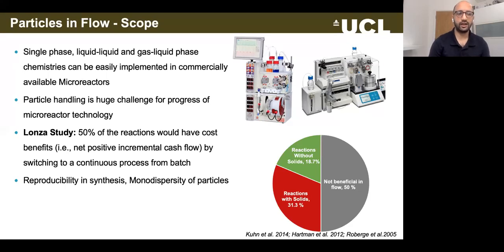And with time, the technology has developed, but it still shows the importance of the scope of the microreactor technology, which can be used to perform different solid-related reactions. So it quantitatively demonstrates the importance of research to develop solid handling techniques to utilize the potential of this technology. And if we are able to make technologies to make solid particles in flow, they will be more reproducible, they'll be more monodisperse, which we always look for when we synthesize different types of particles.